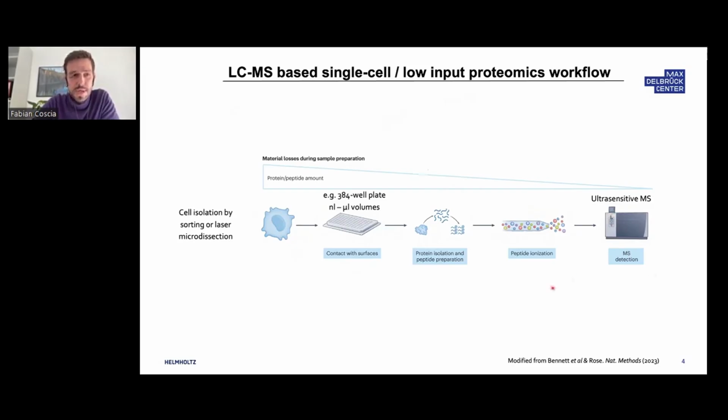This is on the one hand a big leap forward in terms of how we process the samples, using sub-microliter volumes and robotic workflows. But there have also been a lot of innovations from the industry side. The vendors that produce these instruments deliver highly sensitive and innovative hardware that can deal with the relatively low input of ions that come from our biological sample.